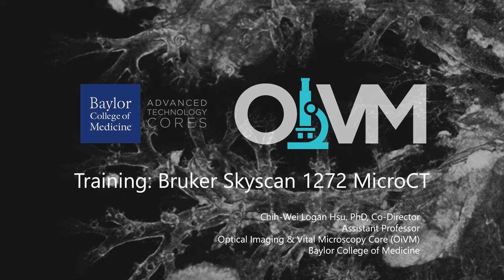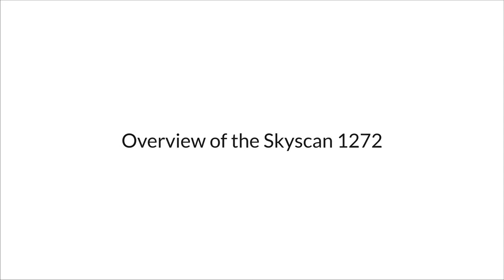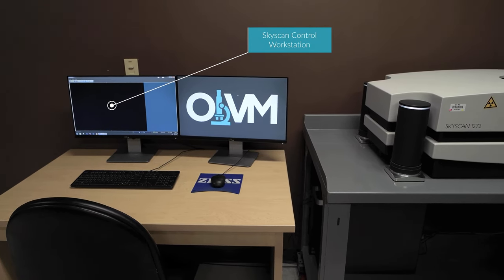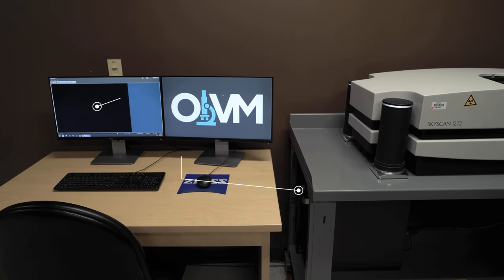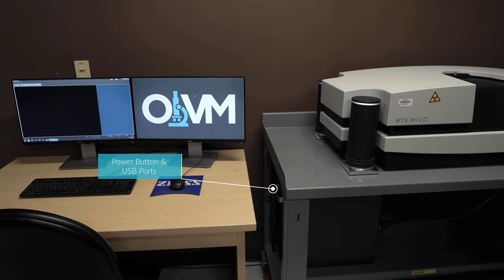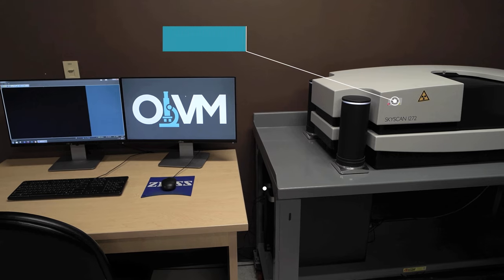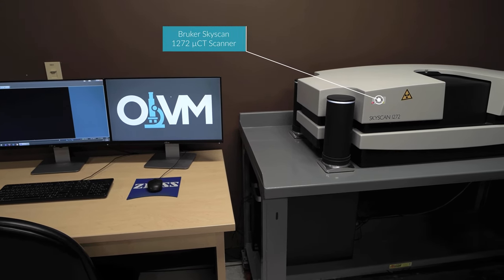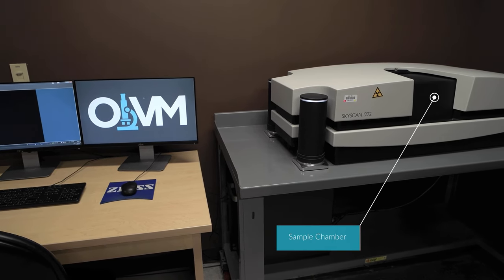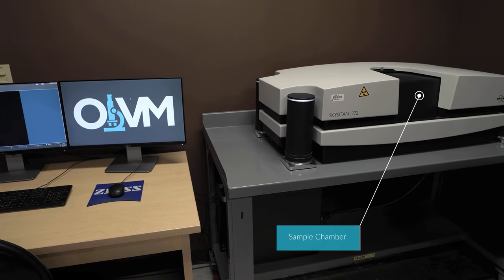Let's first begin with an overview of the major components of the Skyscan 1272. When you come to the Skyscan 1272 workstation within the OIVM core, you will find the host computer on the right hand side of the monitors. Over the top is the compact desktop Skyscan 1272 MicroCT system with the sample loading chamber located at the center. You will also see four LED x-ray status indicators located on each of the four vibration isolation stands.